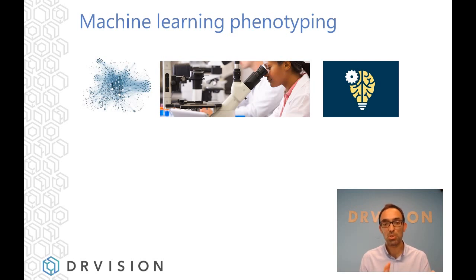Typically people look at one or two parameters that they expect will change, and will track those parameters primarily. Now, in most cases, there are many other parameters that are not looked at, simply because it's not practical to look at all of them for phenotype classification.